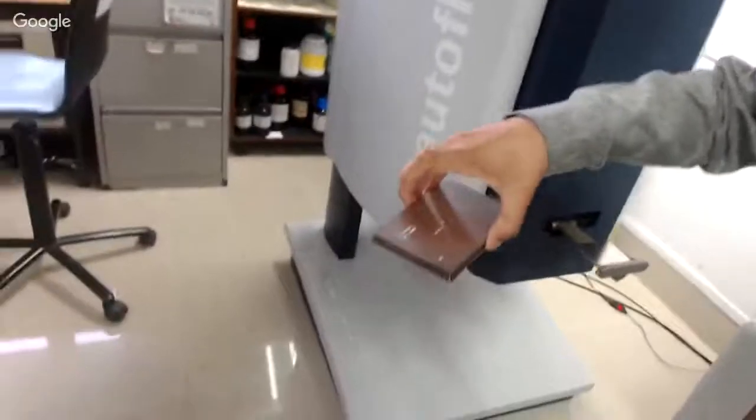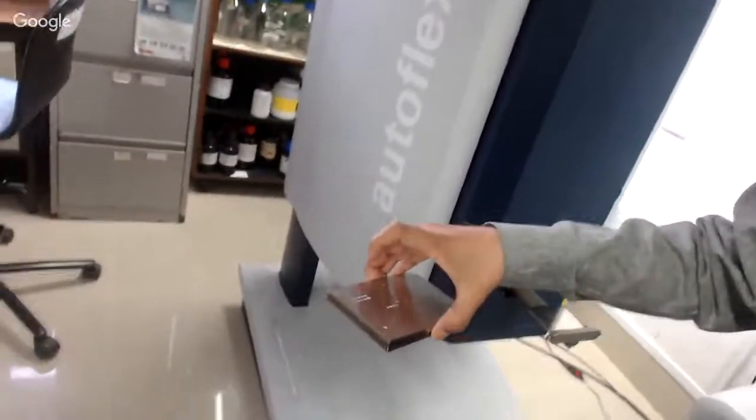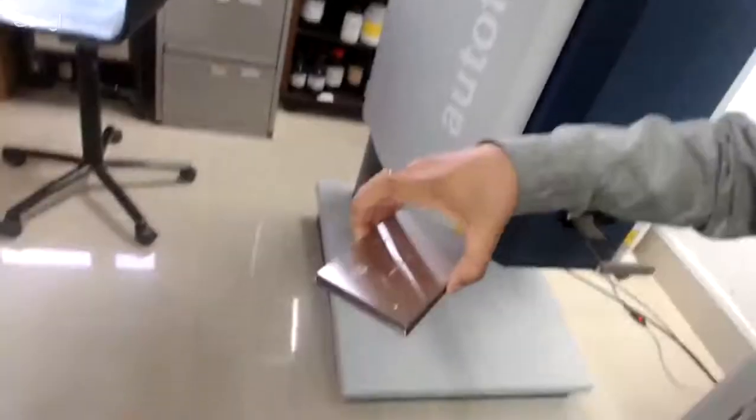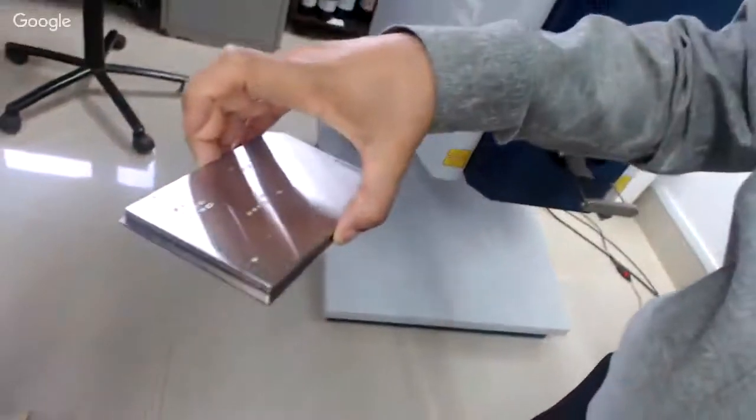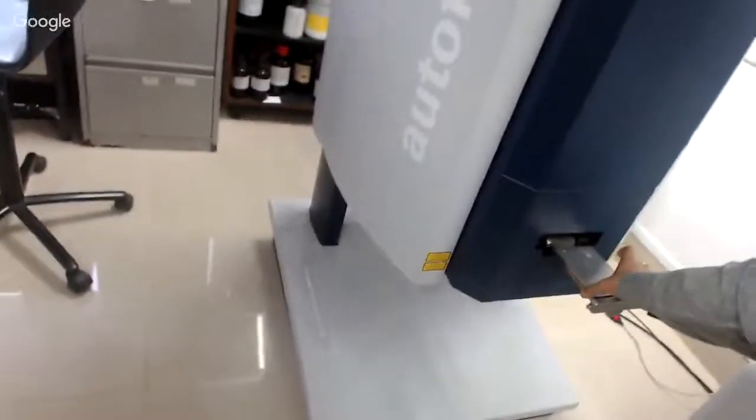All right. I'm trying to be a little hands-on and show you more detail about the instrument. This is a MALDI plate on which you can put your samples of interest, and you will see that in much more detail. Then you place it inside this particular slot to insert the plate, and after that, everything is pretty much software operated. So let me go back to my position.